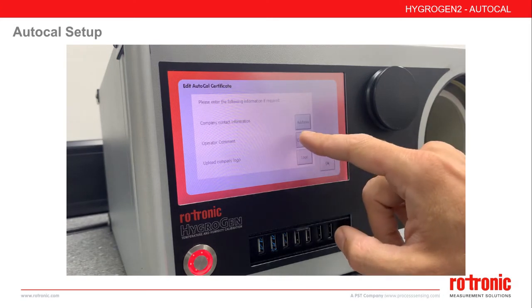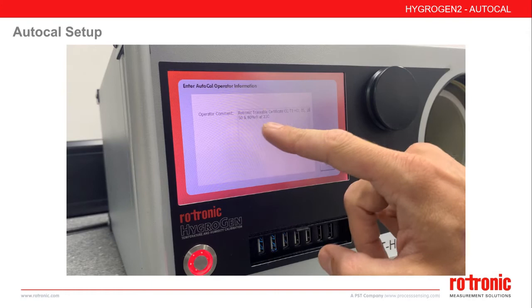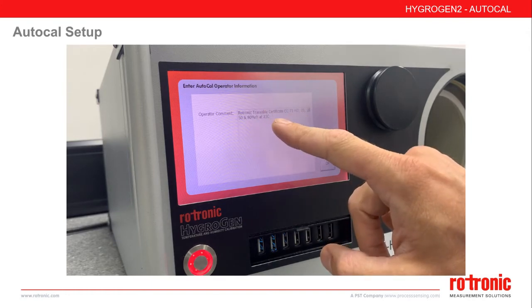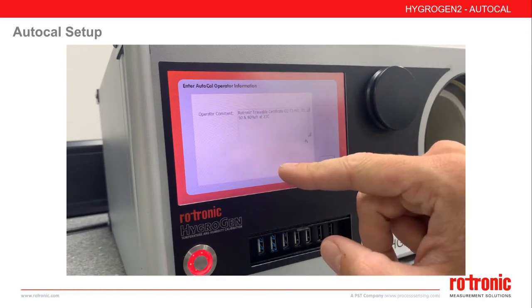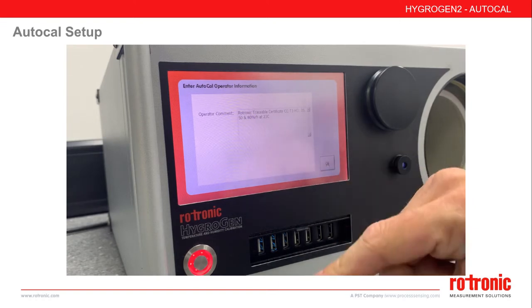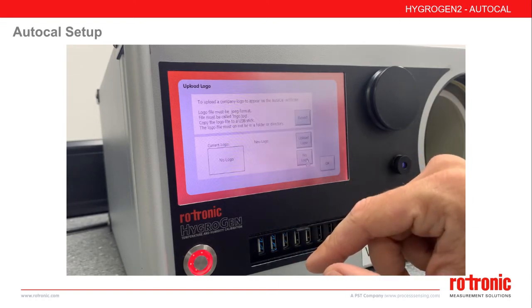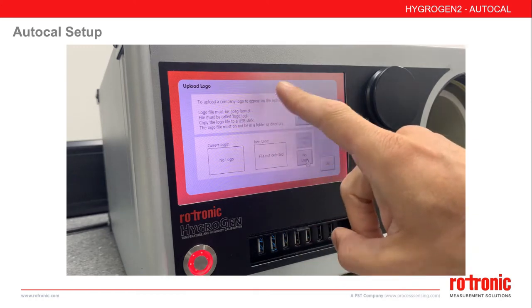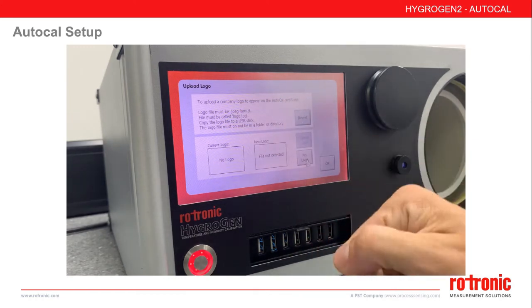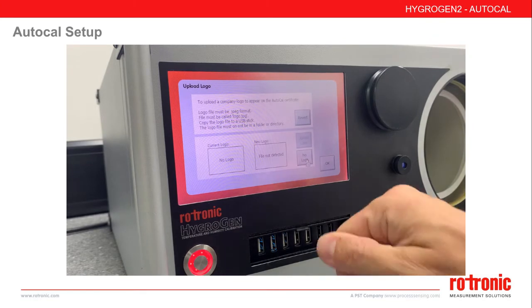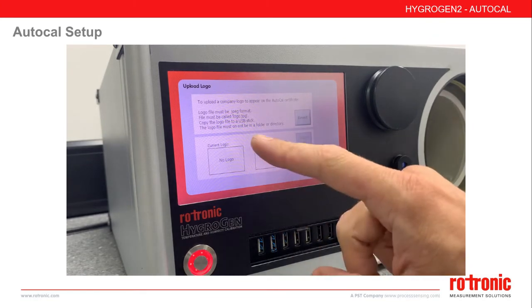In addition, during every run it is possible to enter and add an operator comment. You can also add a company logo. By default, the Rotronic logo will be used. If required, you can upload your own logo by inserting a USB stick and following the commands on the screen.